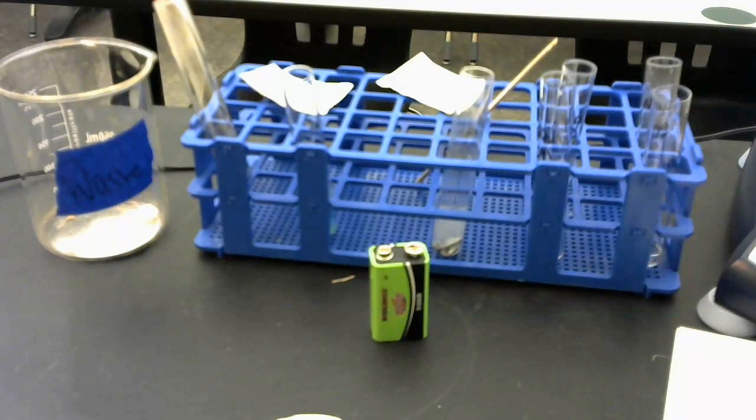Now your last reaction is a reaction that is not at your lab station. The last reaction is going to be your alcohol burning, and I'm going to go ahead and do that as a demonstration. The students who are in class are going to watch the video rather than doing that yourself. And hopefully all of this was helpful. Make sure that you balance your reactions, you write your word equations. This lab is very detailed. It should take a little bit of time, but hopefully you enjoyed going through the different types of chemical reactions.